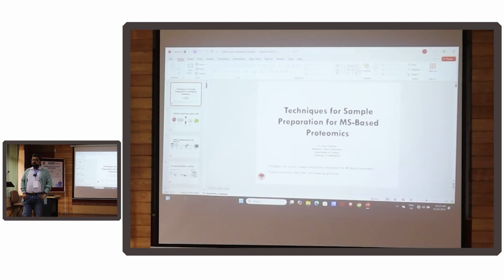See, as I said, there are no foolproof methods. You can use some enzymes to degrade it as well, but the moment you add enzymes, you add noise. So you have to standardize. Since I do not work much on plant cells, I cannot give you the exact methods. But there are groups in NIPGR, the National Institute of Plant Genome Research.